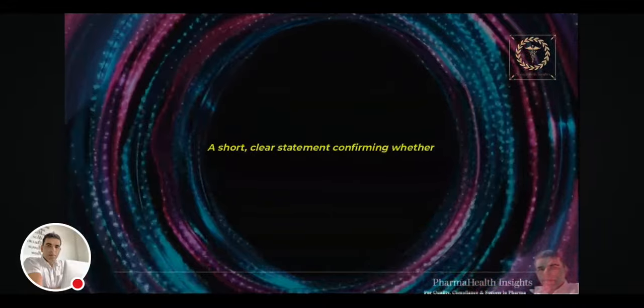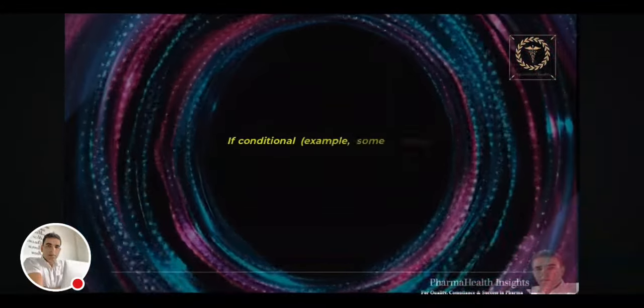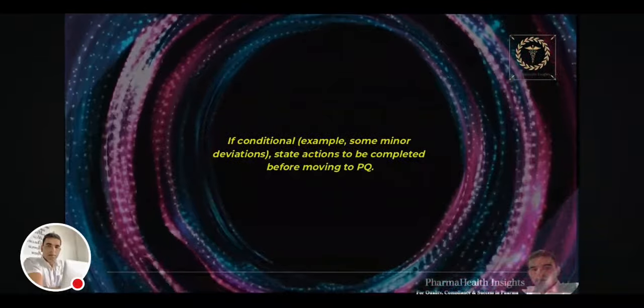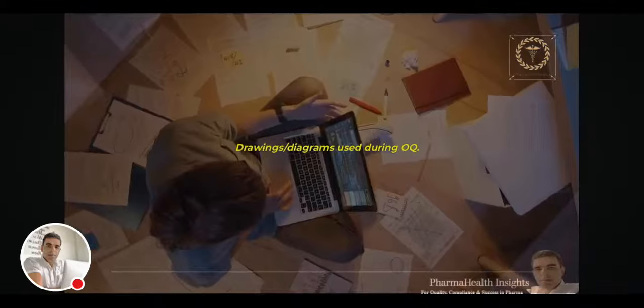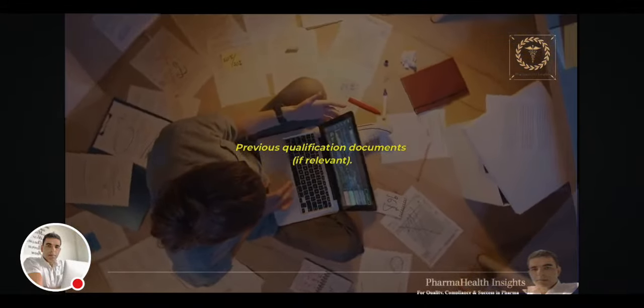A short, clear statement confirming whether the equipment passed or failed OQ. If conditional, for example, with some minor deviations, state actions to be completed before moving to PQ. 10. Attachments: calibration certificates, drawings, diagrams used during OQ, equipment manuals, previous qualification documents, if relevant.